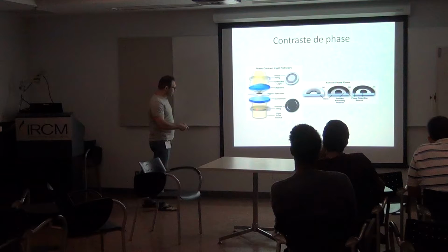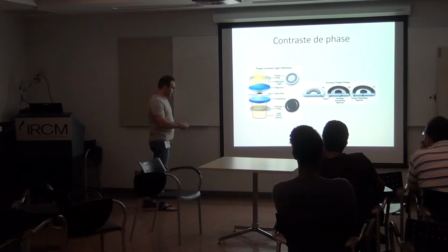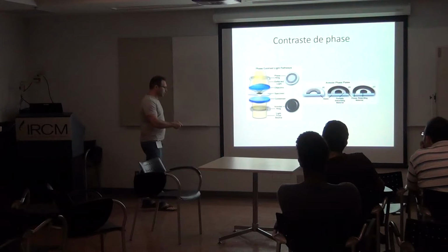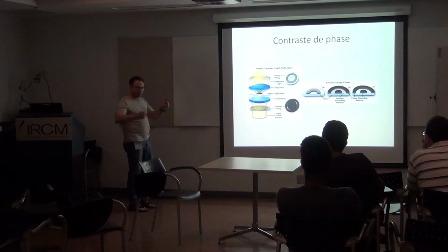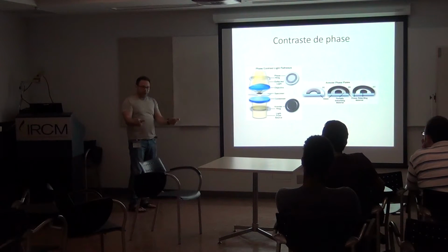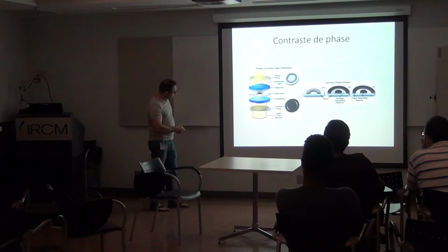Okay, so you block the light everywhere else, in the center and on the edge, and so light goes into a cone. Okay, but a cone which would be filled only with light, and here it's totally black. So you have light that goes like this and is focused onto your specimen.